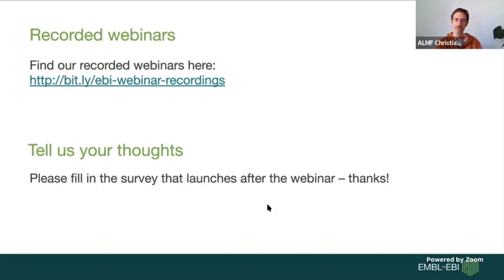Co-localization is very, very difficult, and for each problem, just running some standard code will probably not work. So you have to think about it, probably invent your own method, and there I would really highly seek some professional help from someone that is really into bioimage analysis. It's just a really difficult problem. So I would not just use some plugin, would be my answer.